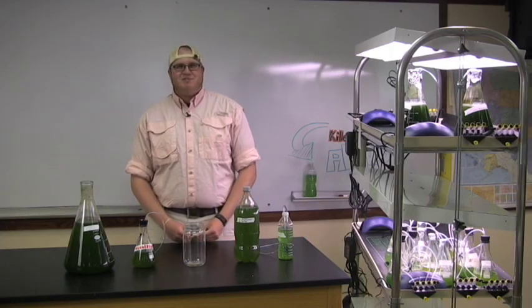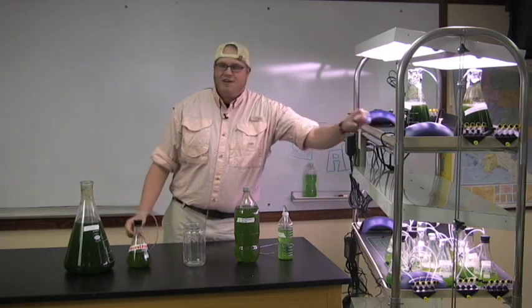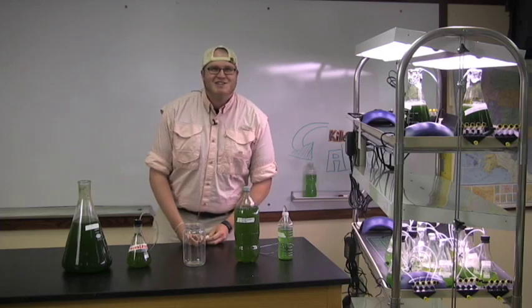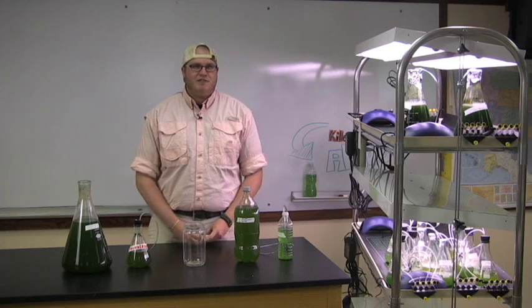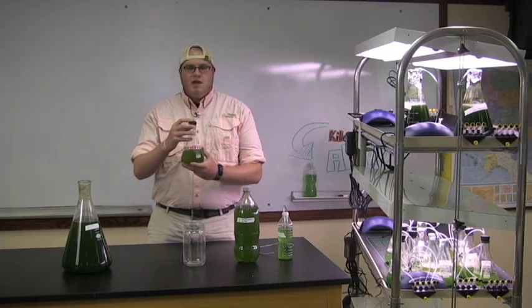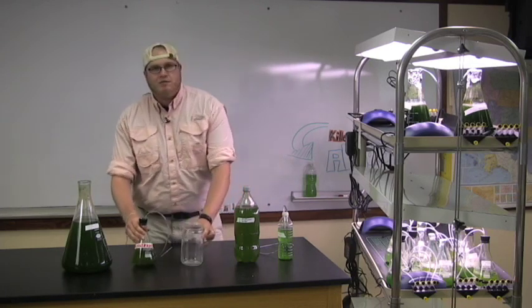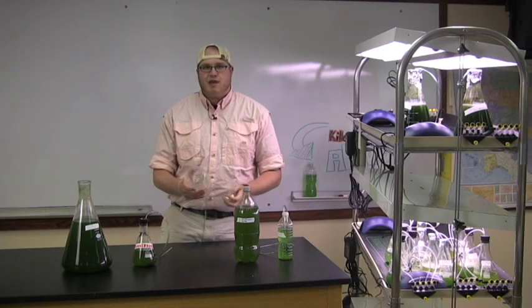In the lab, we primarily used 500 milliliter Erlenmeyer flasks, as well as 2 liter and 4 liter Erlenmeyer flasks for growing our algae. We chose the Erlenmeyer flask because the angled sides give more surface area for light penetration and the narrow mouth makes manipulating the flask easy. We used 2-hole rubber stoppers atop all our flasks, running airline into one hole and pressed cotton into the second hole to filter outgoing air. We avoided wide-mouth glassware as it led to higher evaporation rates and left the culture open to contamination.